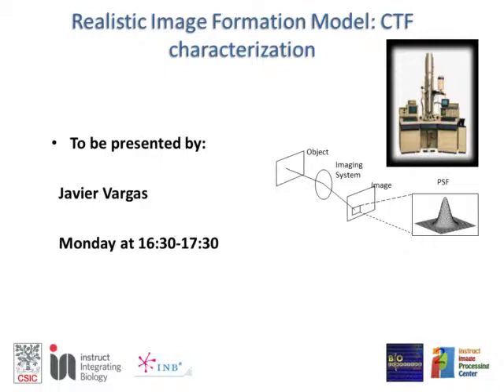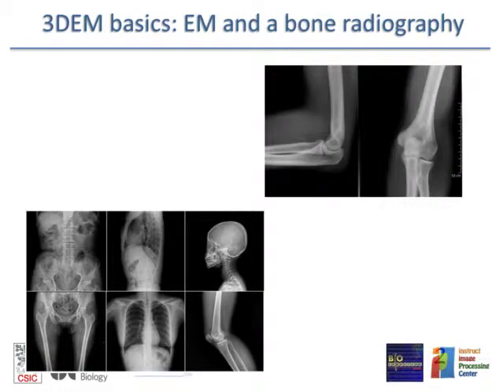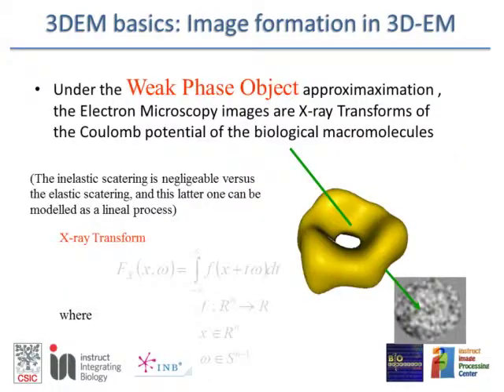Okay, fine so far? Just a question. On that first slide, there was that the inelastic scattering is negligible compared to the elastic. Yes. Does that mean that it is transparent? Yes. Especially on this one, it is basically transparent. It's the weak phase object. Yes.